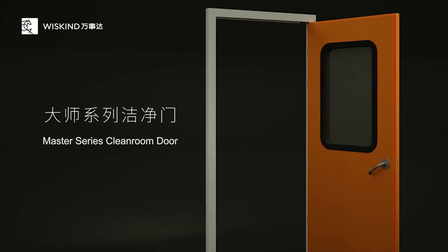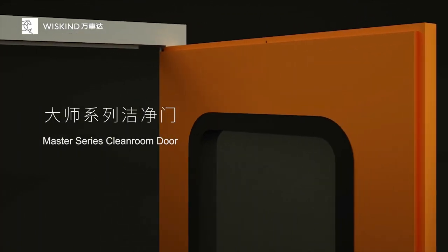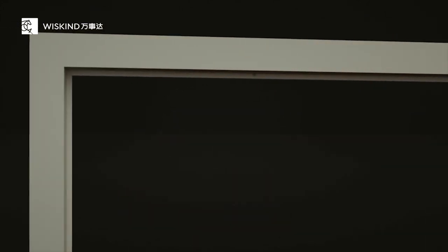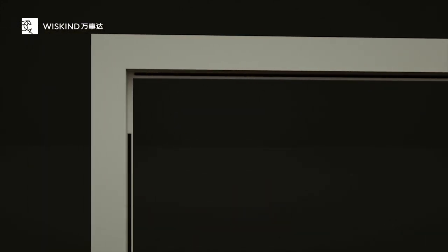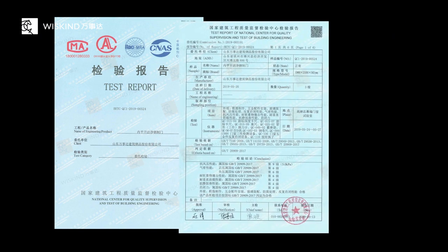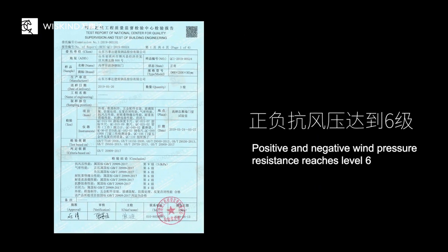For this reason, the Master Series Clean Room Door has made a more thoughtful protection design. A seal is set on both the door leaf and the door frame. The two seals adopt different sealing technologies, so the double air seal is more reliable and the air resistance is greater. The quality supervision and inspection center tested that the positive and negative wind pressure resistance reached level 6.